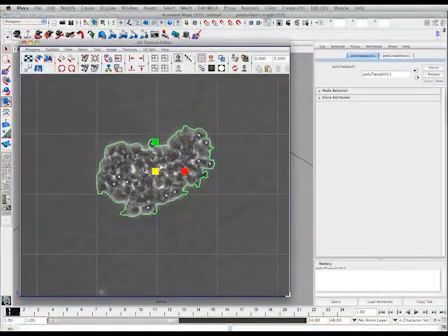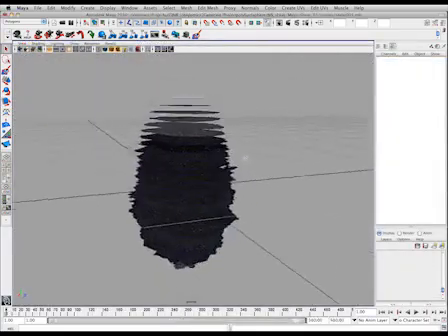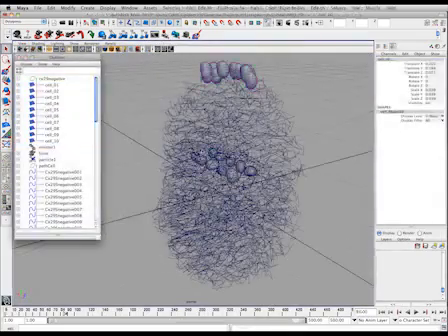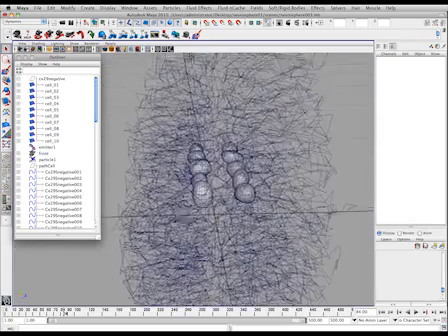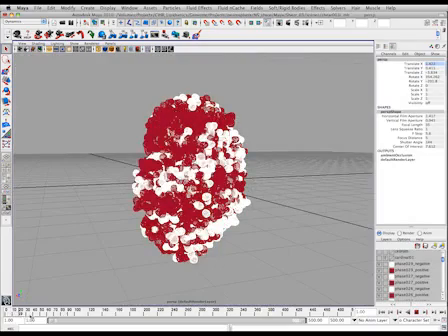Visualization of proteins within the context of their native three-dimensional structures, such as a free-floating neurosphere or a tissue, allows for a better understanding of protein function based upon location within these structures, and also allows the inference of possible roles for proteins with known localization but unknown functions.